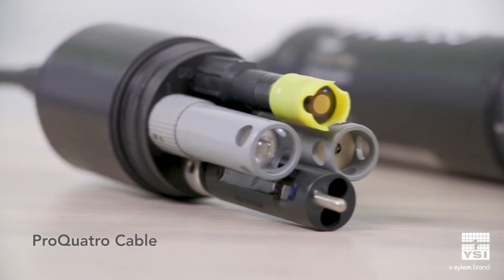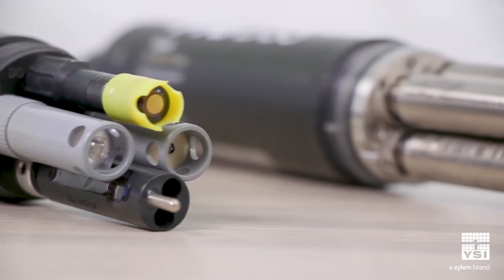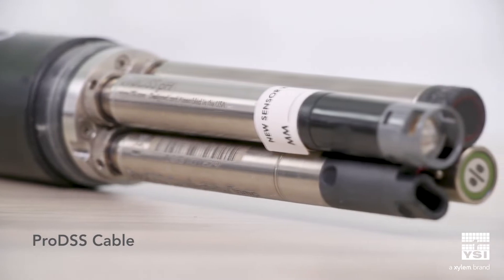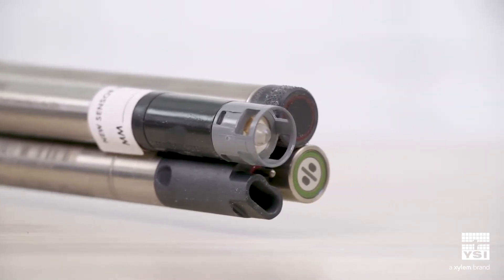The Pro Quattro and Pro DSS are highly customizable with multi-parameter four-port cables in a variety of lengths. The universal sensor ports of the Pro DSS cable accept any combination of digital smart sensors, giving you full control of your measurement options.